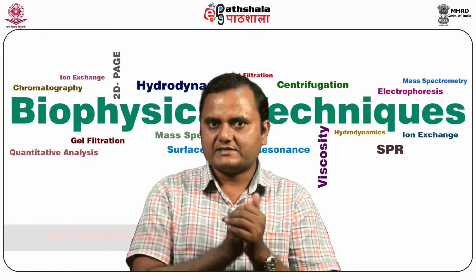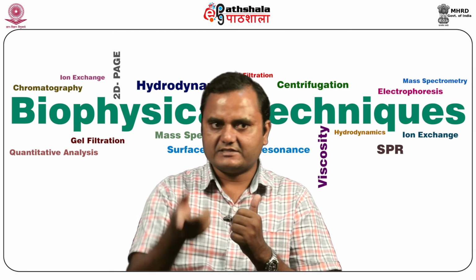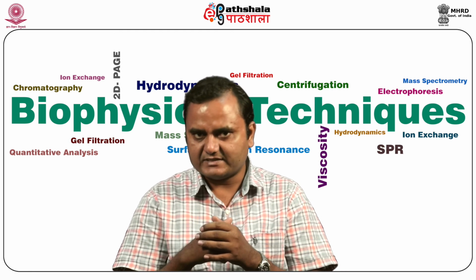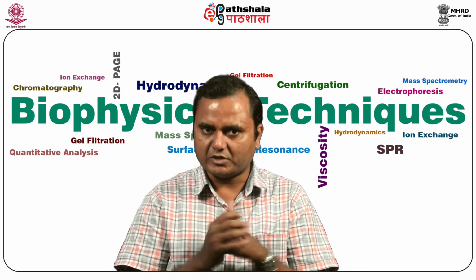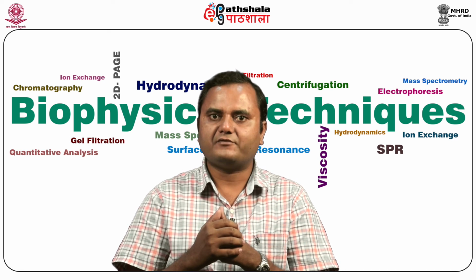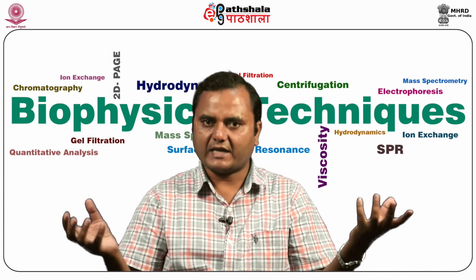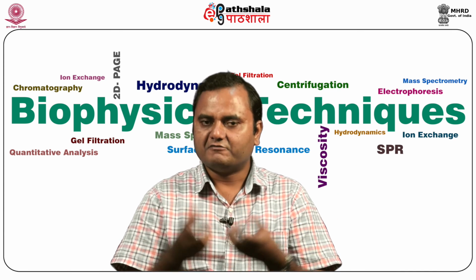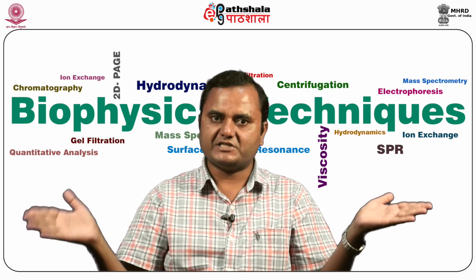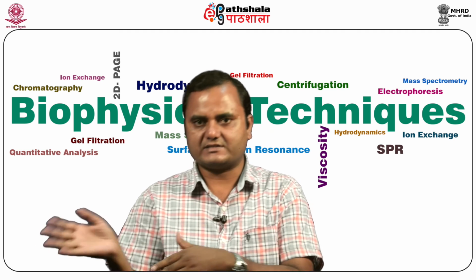The other part is the sedimentation equilibrium, so sedimentation velocity, and the next is the sedimentation equilibrium. In the sedimentation equilibrium, it is also used for the measurement of molecular mass and subunit stoichiometry. It is useful for the measurement of the equilibrium constant for hetero-associating systems, like how two systems are capable of associating together, what the binding constant and equilibrium constant are, under what conditions this equilibrium is changing, and when the equilibrium is shifted towards the aggregation side or towards the monomer side.